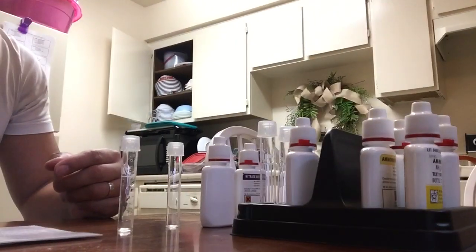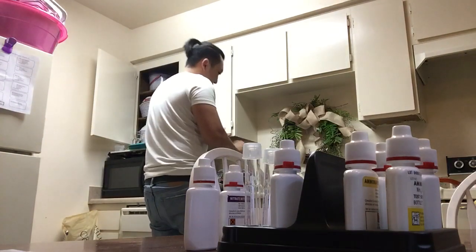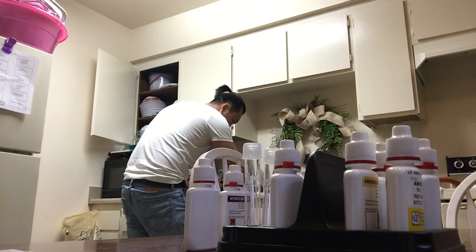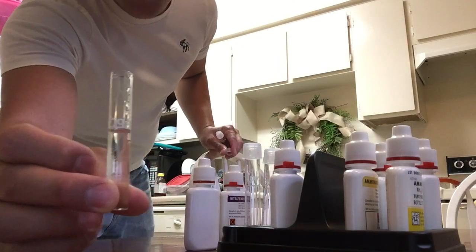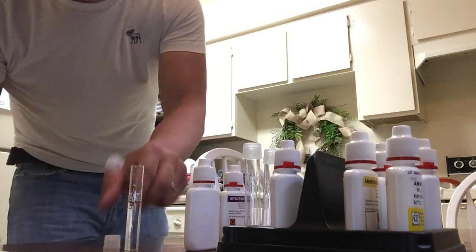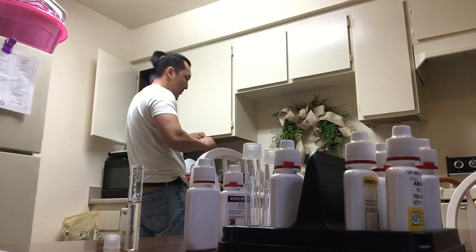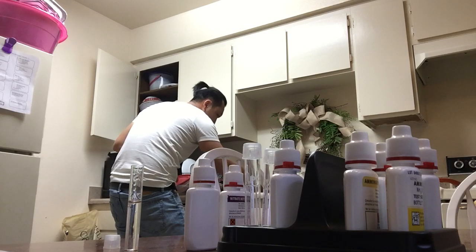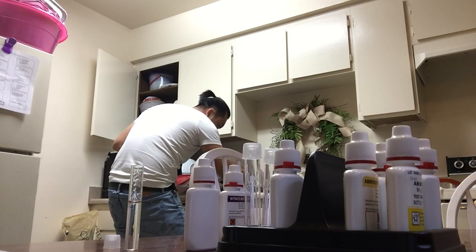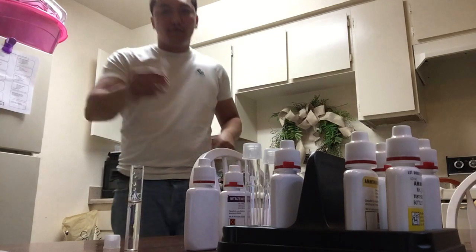My water here is pretty bad so I will fill up the vials right now. This one will be right off the tap — 5ml right there. And the second one, I will turn on the filter. And that is 5ml.